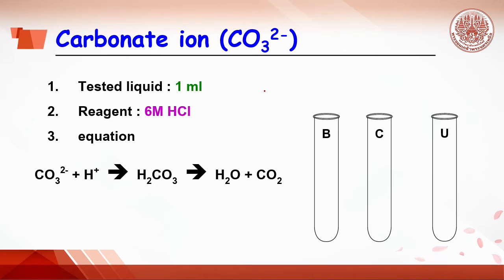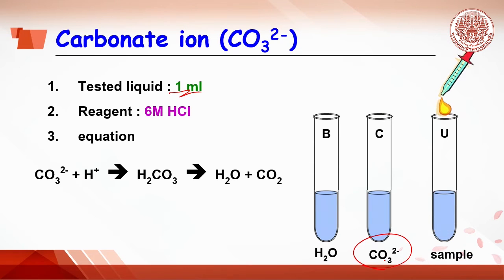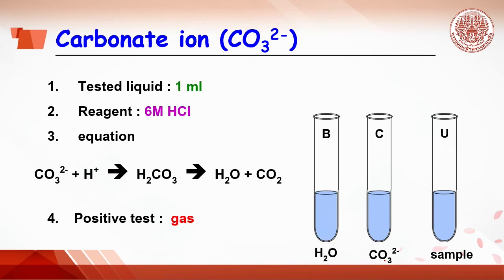For example, carbonate ion testing: 1 mL of testing liquid like water is dropped into the B tube, 1 mL of sodium carbonate which is carbonate ion is dropped into the C tube, and 1 mL of unknown sample is added into U tube. The reagent for carbonate ion testing is hydrochloric acid. Each tube receives hydrochloric acid. Observe the reaction. Carbonate ion reacts with proton or acid to get carbonic acid which is not stable, so it decomposes to get carbon dioxide gas. The positive test for carbonate ion is CO2 gas.